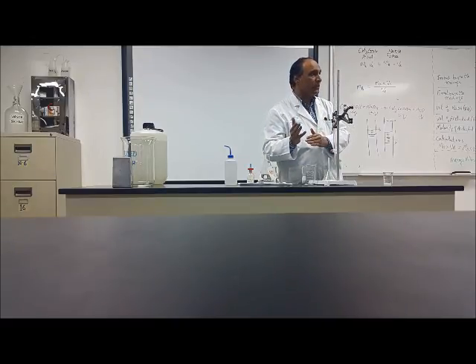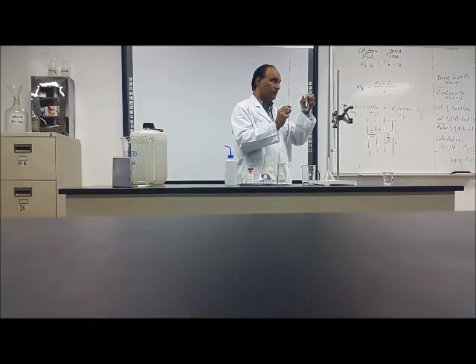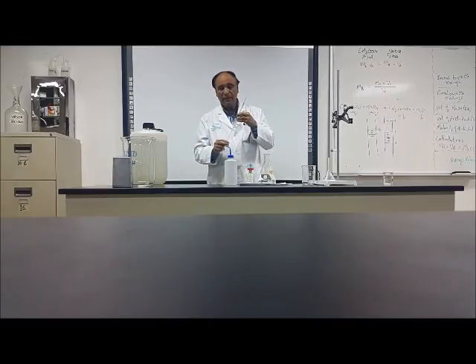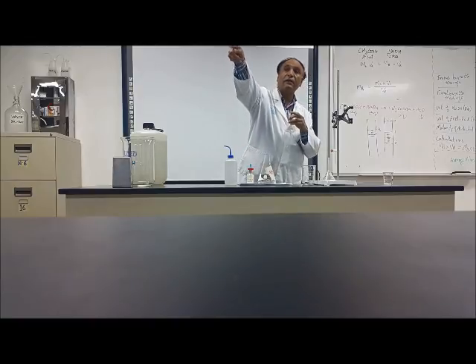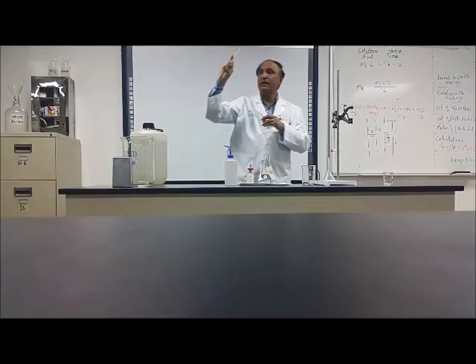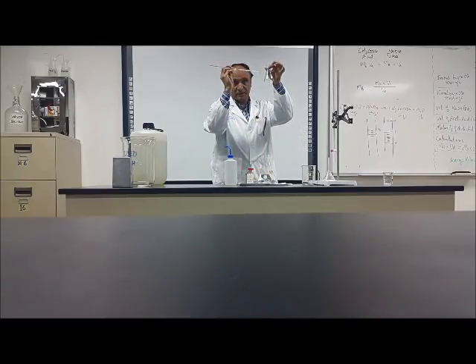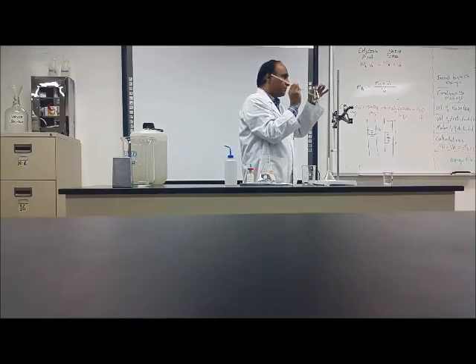The other student will take these two things. Second student, did you understand what I am saying? Yes. And he will take acetic acid, this acetic acid. I have placed the acetic acid in 4 places. You can see that one, 1, 2, look there, 3 and 4. I have put it in 4 places. The other student will take these 2 things. Not only one, 2 things. Okay?